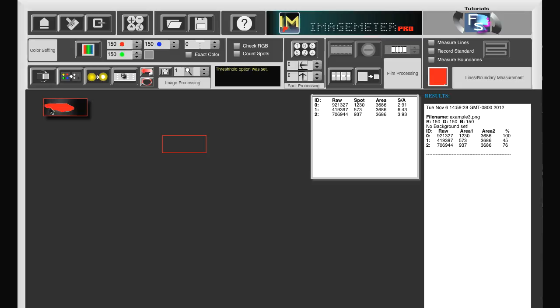It shows that none of the pixels, which were used for the calculation, were derived from the background. And this concludes this lesson.